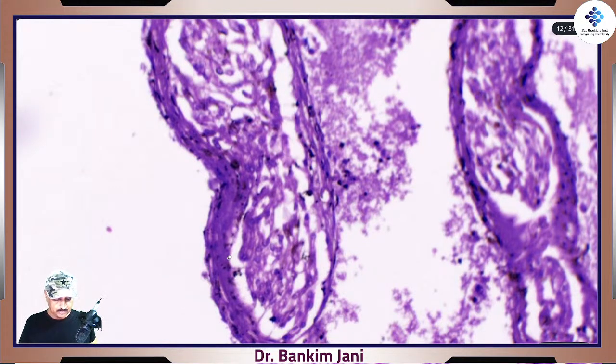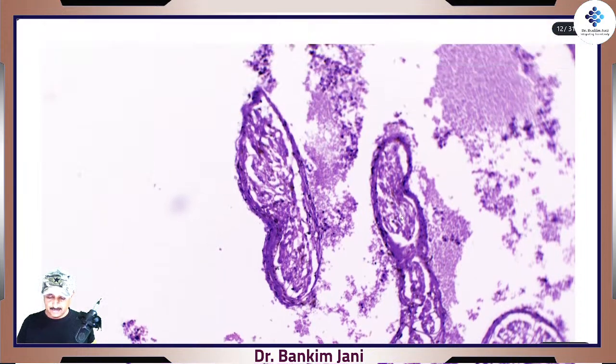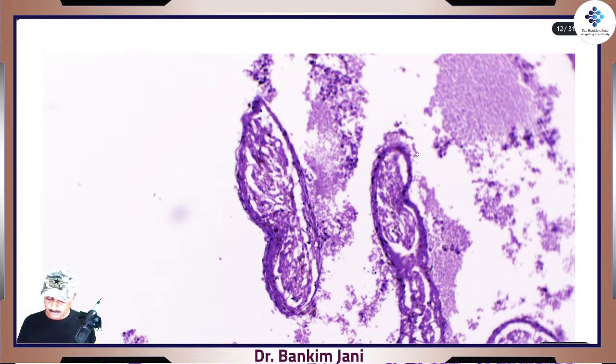These are the squamous cells because they are in the wall of the atria, or the cardiac wall. In any wall you pick up, this is the wall, and all of them are like this.